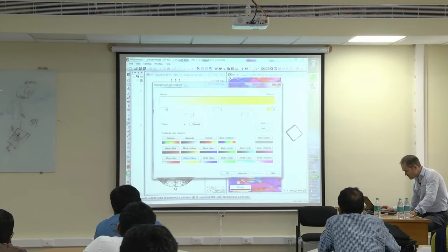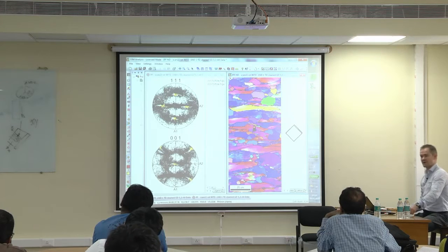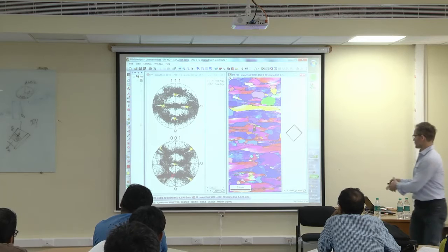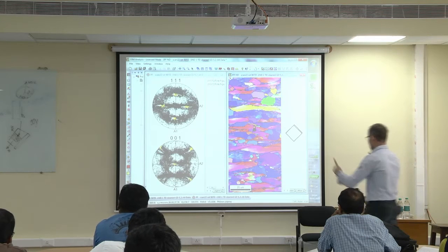Okay, this time I go for yellow. Reverse, okay. Click into that one here, click. It will search all points belonging to that grain, and indeed, whoop, I was right. You see, this is coloring here quite in the center, so the 001 direction is pointing.